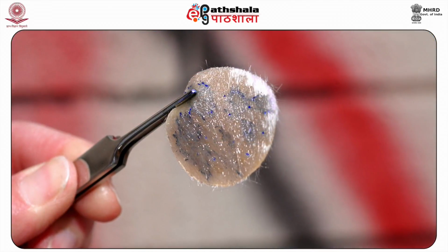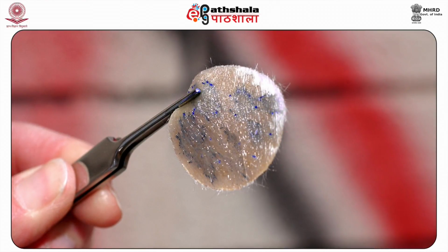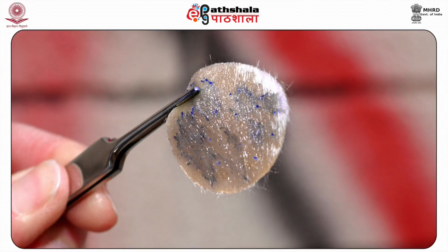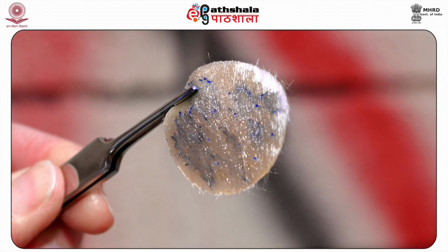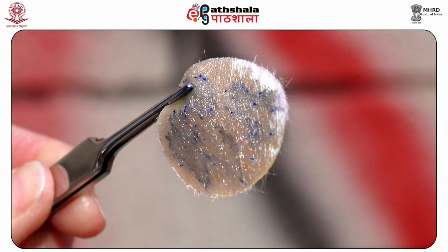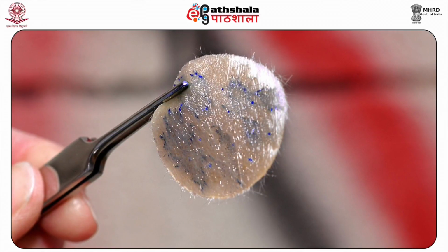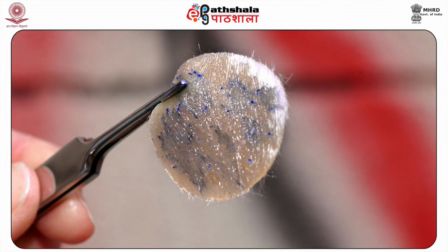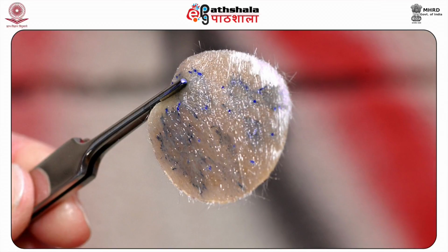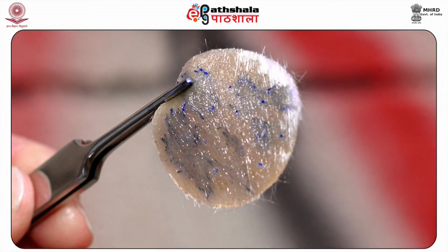The suspected element in GSR is taken in an atomizer, a graphite tube or tantalum strip, and is excited by heating. The radiations from a discharge tube with the suspected metal electrodes are passed through the atomizer. The loss of intensity in radiation gives the quantity of the metal in question. The technique is very useful and popular for the examination of GSR particles.